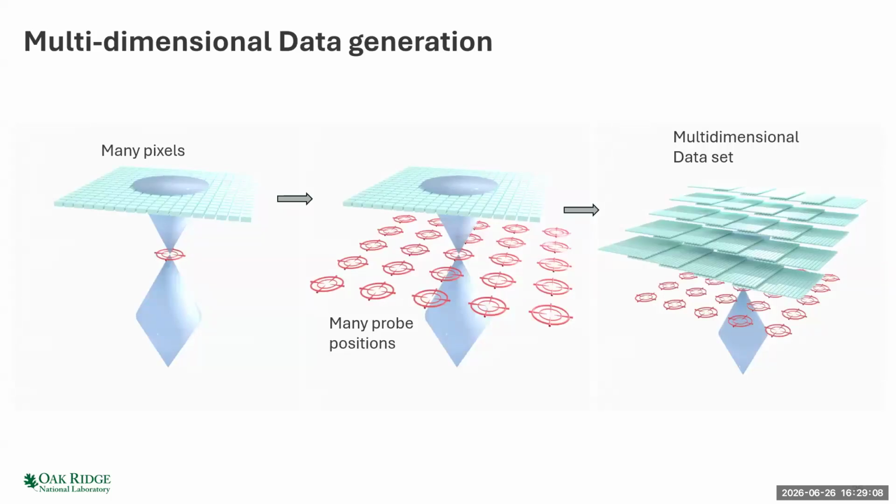So if you think about it, our detector now has many pixels. A lot of detectors are 1K by 1K pixels or 2K by 2K. These timing-based pixels are still probably around 512 by 512 pixels, but you can either tile them or you can interpolate a little bit, looking at where the center of those clusters hits. So you can have many more pixels on the detector.